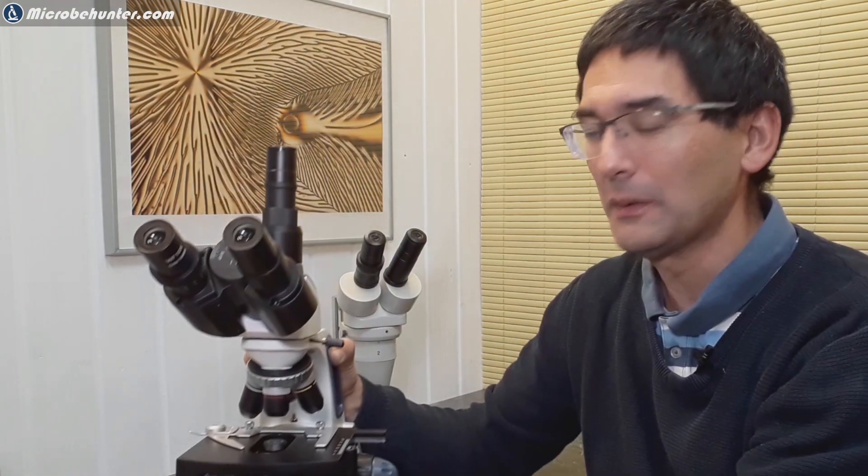If you already have a microscope like this then I probably would not consider upgrading to a more expensive microscope like the Olympus CX33 or 43. The reason being not that those microscopes are not good, far from it, but you do not gain any new features and therefore you're essentially able to see the same things as you are able to see right now.